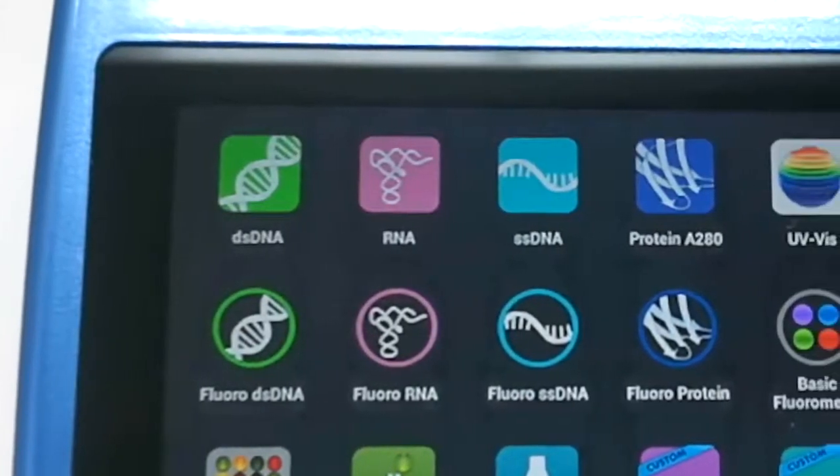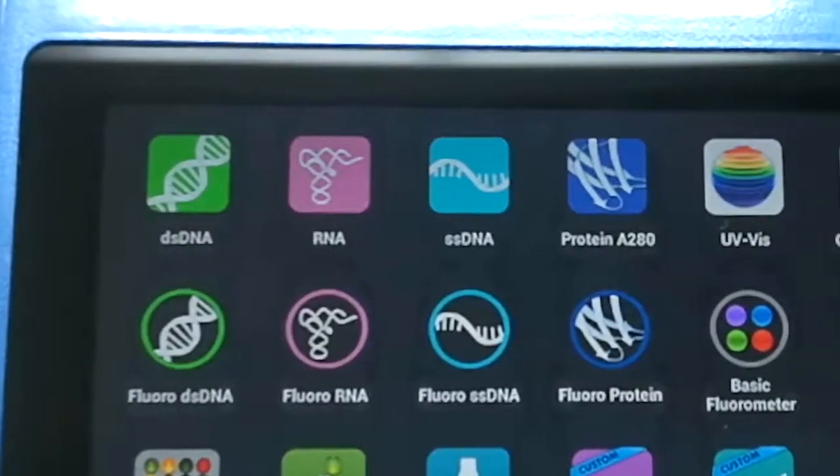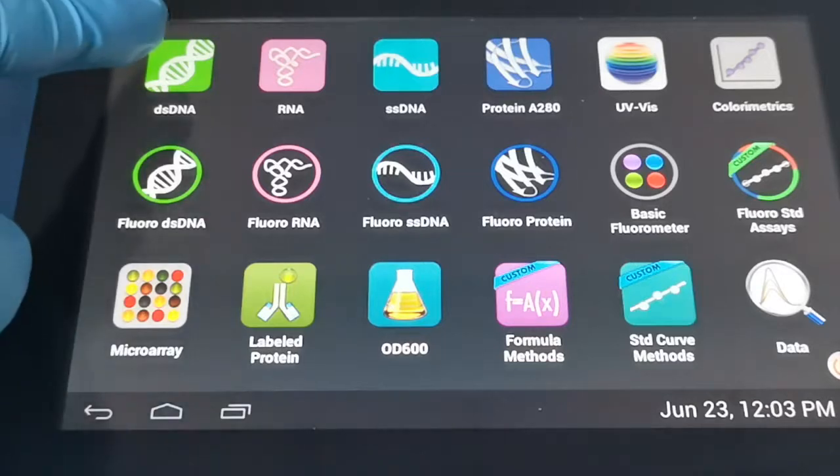So for the purposes of this demonstration, we're going to concentrate first on double-stranded DNA, and then we'll take a little look at some of the other measurement apps and show you some of the kind of unique characteristics of those. So first thing we need to do is just start up the app just by touching it.